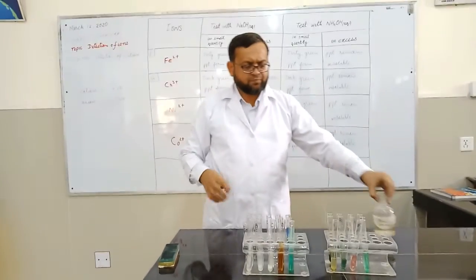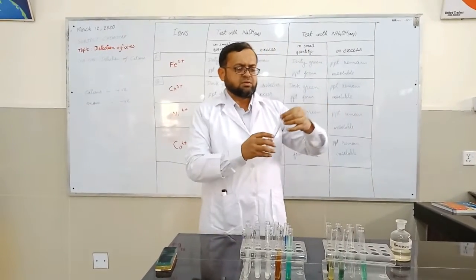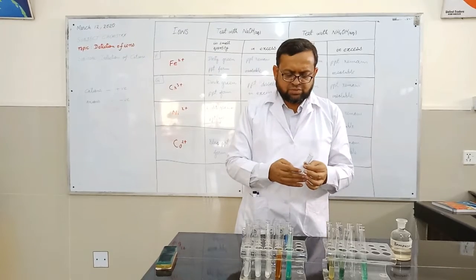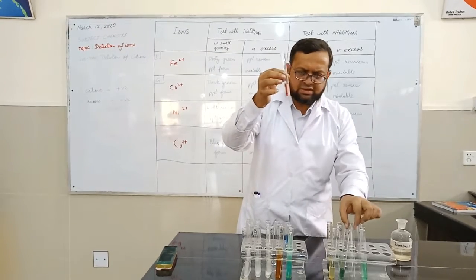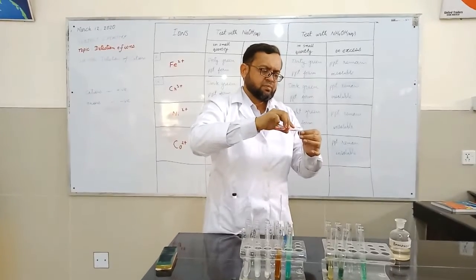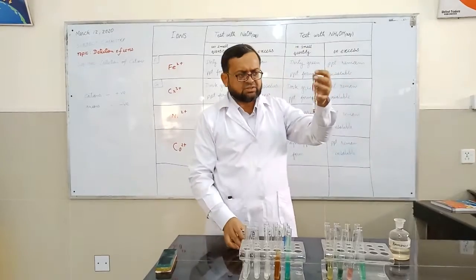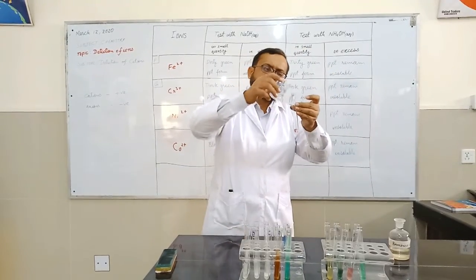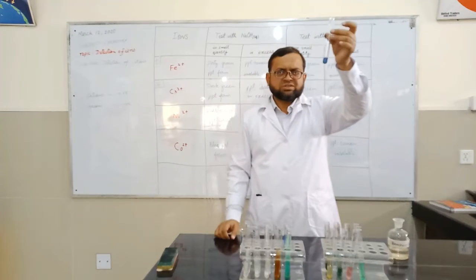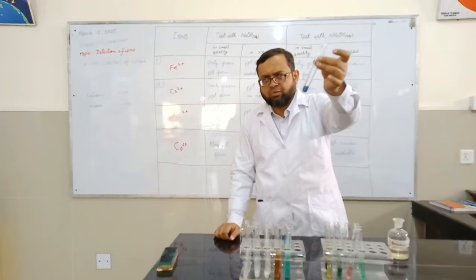All the details must be closed. Okay. Now come to another sample, H. In sample H, you can observe the color is pink. We have taken a small quantity of this pink solution, sample H, and I am adding a small quantity of sodium hydroxide. Oh, what's the change? Blue precipitates are formed.